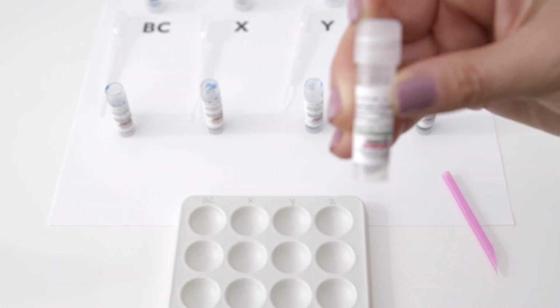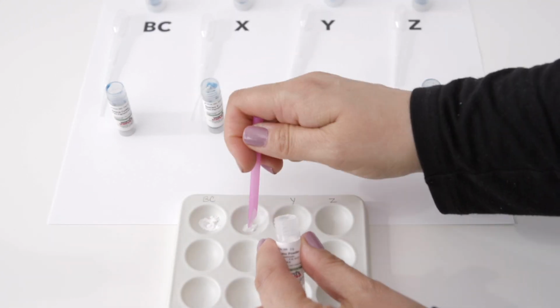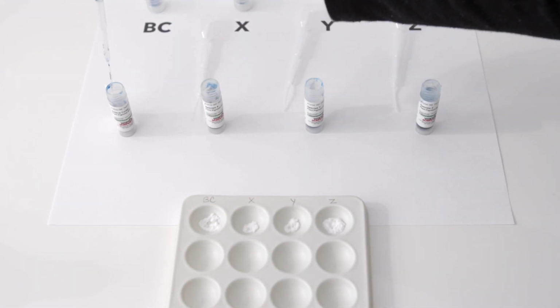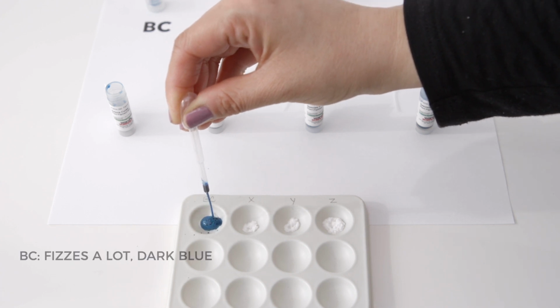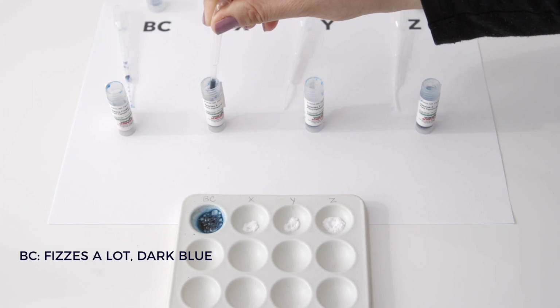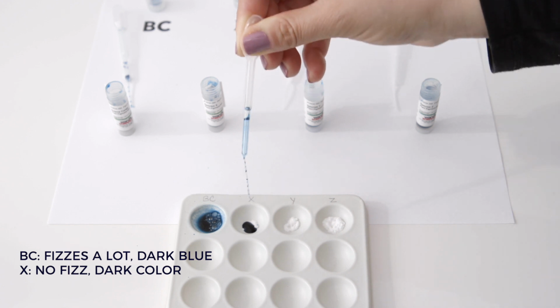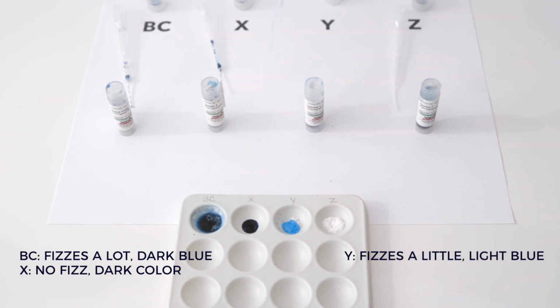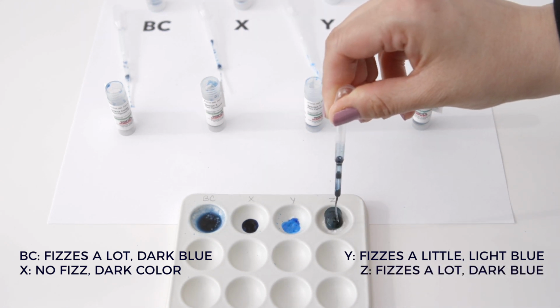For this test, put a small scoop of the indicator powder into the depressions of the well trays. Then use clean microtip droppers to add each plant extract to the wells and observe the reactions. Here are the observations. Botana curis fizzes a lot and produces a darker blue color. Species X does not fizz and has a darker color. Species Y fizzes a little and produces a lighter blue color. Species Z fizzes a lot and has a dark color.